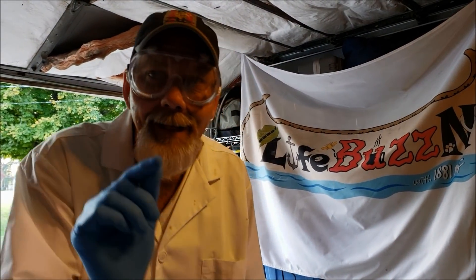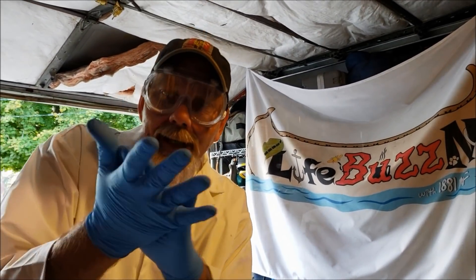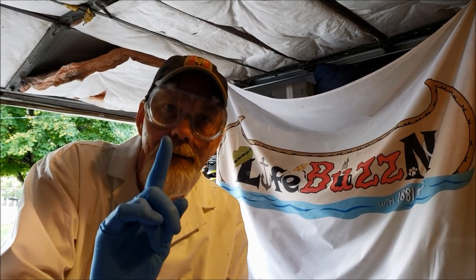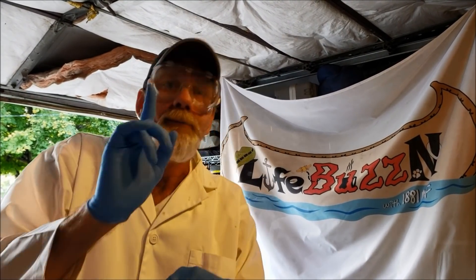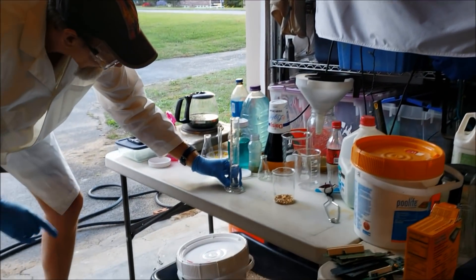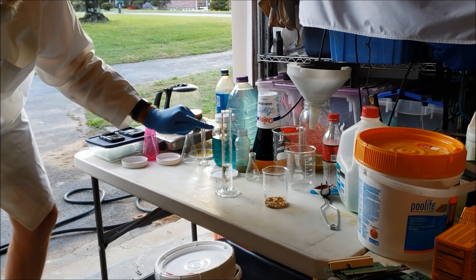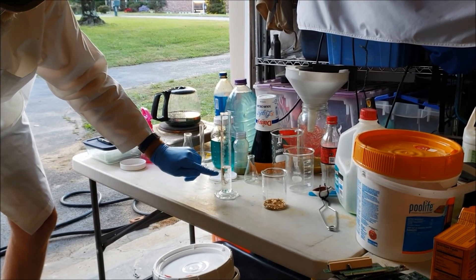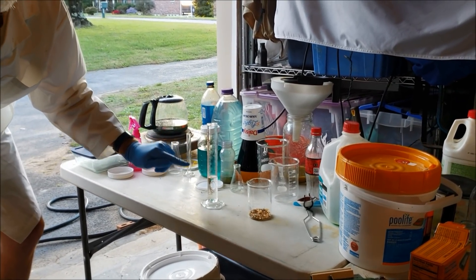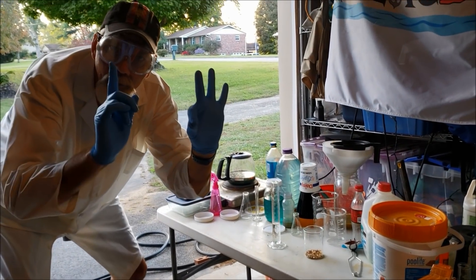To one part nitric acid. I'm not going to take that out because I have it in my safety spot right now, and I have gloves on by the way. One part nitric acid, three parts muriatic acid. I put in 30 milliliters of muriatic acid and 10 milliliters of nitric acid — three to one.